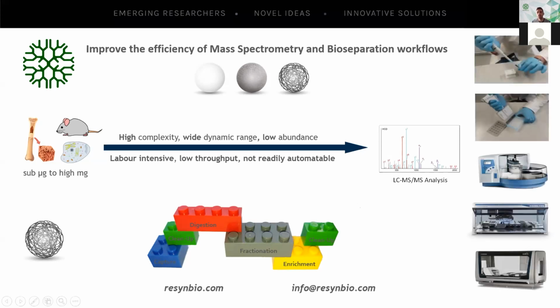So ultimately, our aim is to transition from few samples to many samples, to be able to scale the process seamlessly, as well as to transition from manual to automated workflows in a manner that doesn't require major reoptimization of the workflows.